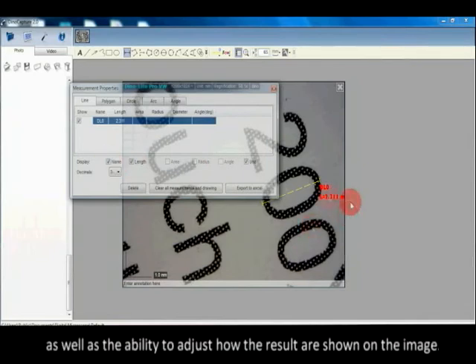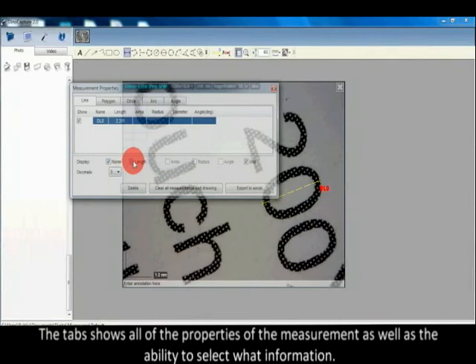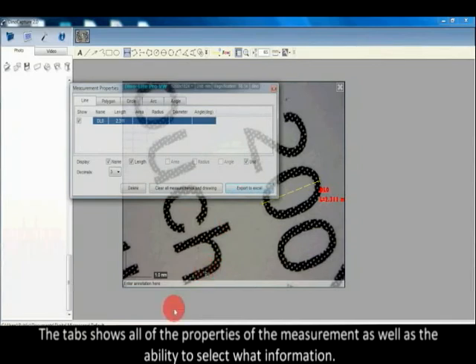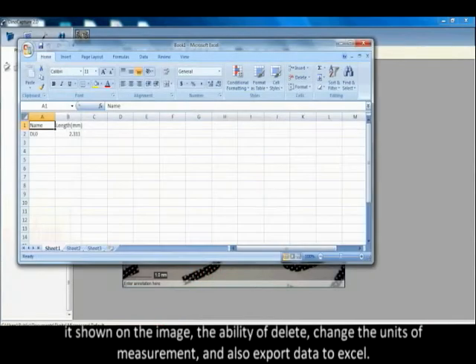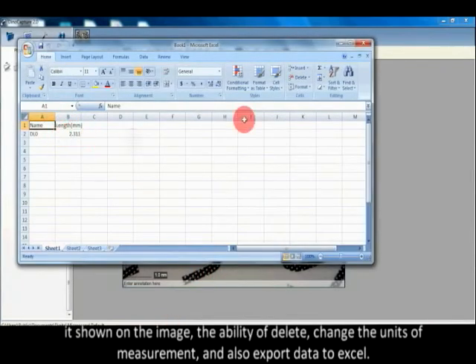The measurement property window organizes and shows the status of all measurements, as well as the ability to adjust how the results are shown on the image. The tabs show all properties of the measurement, the ability to select what information is shown on the image, the ability to delete, change the units of measurement, and export data to Excel.